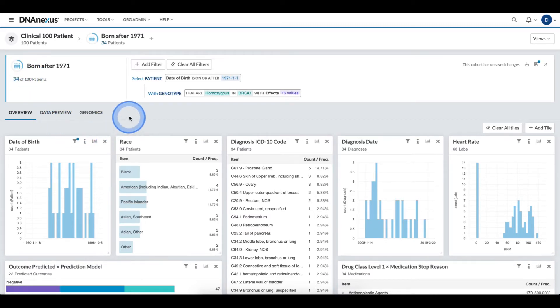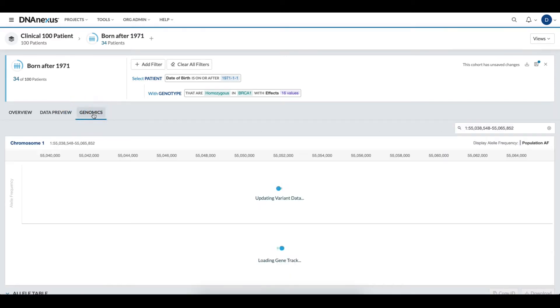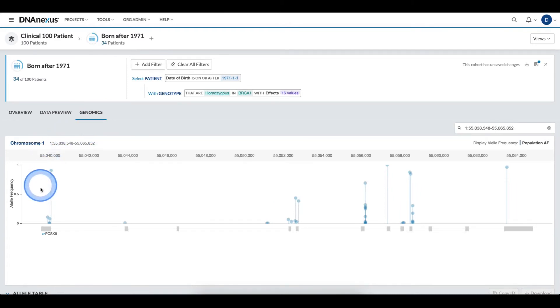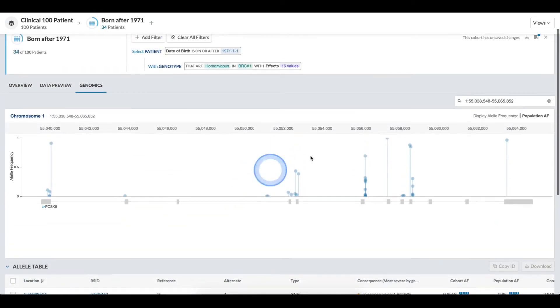To better understand the genomic profile of this cohort, I click the Genomics tab in my dashboard, and I can see various allele frequencies along with a specific table for this particular region.